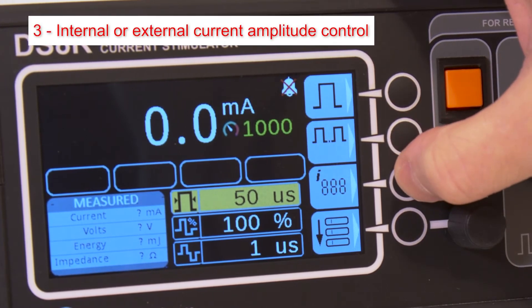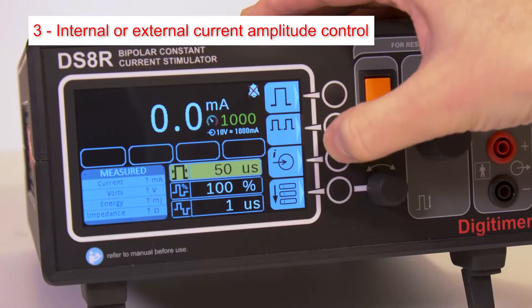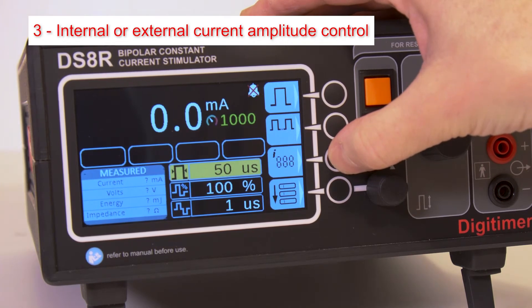The third button switches between internal and external amplitude control modes. Internal control is via the main front panel dial or an active USB connection to a host PC. External control relies on an analogue voltage signal connected to the rear panel control BNC socket. Holding this button down for several seconds also zeros the control input when in external control mode.